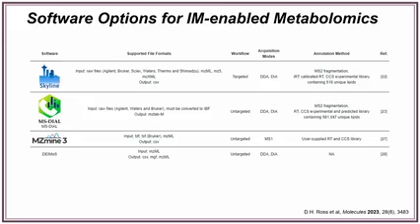So we're talking about Skyline and MS-Dial, and then Tomáš will talk about MZmine 3, and Christine and Jess will talk about DEIMoS. You can see this nice table from Dylan Ross in this Molecules paper coming out of PNNL that really nicely summarizes all the benefits for these different setups. They cover both untargeted and targeted experiment styles. Some have the capability to look at data-independent acquisition of MSMS, others include DDA as well. Some have built-in libraries that allow you to do the identification process within the software. Others do not.